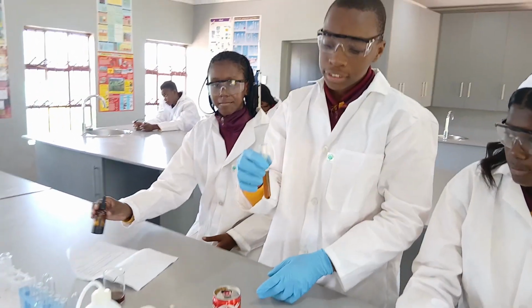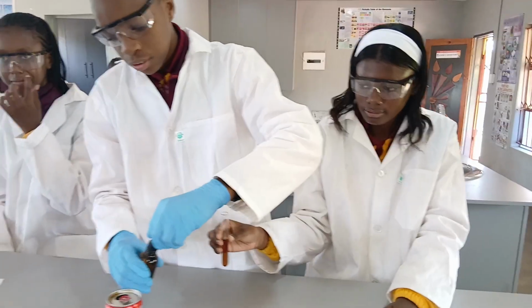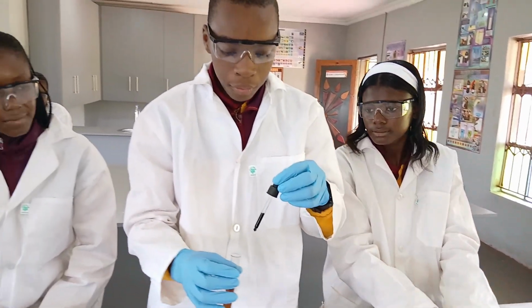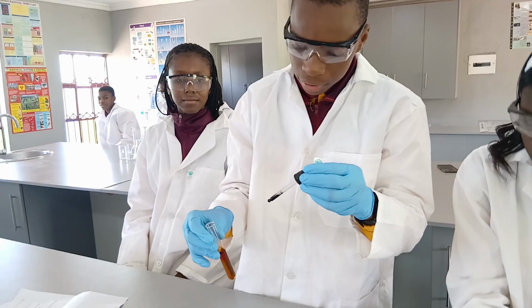So this is our first test tube. The sample in here is... so we're going to test if it is an acid or base. We're going to pour 2 drops of our universal indicator. After we do that, we'll have to shake it.